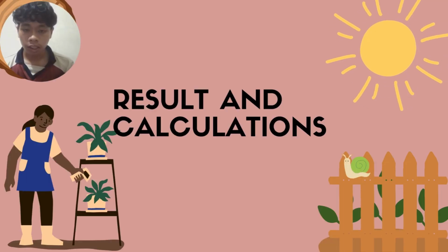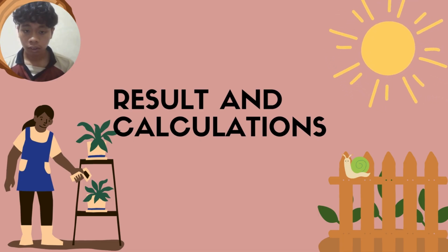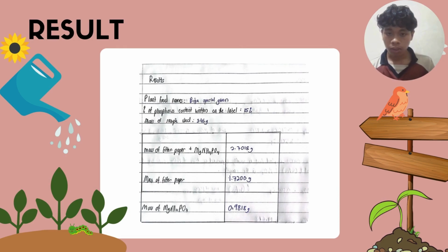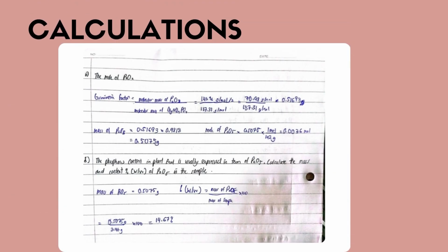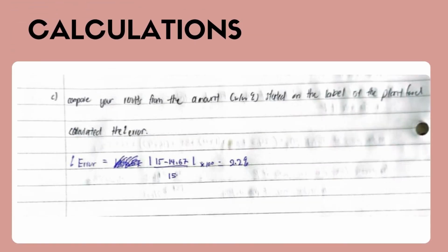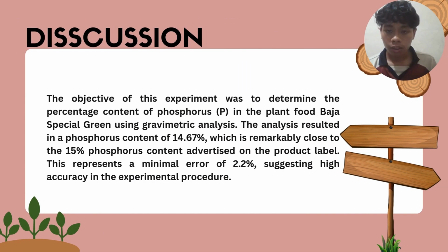Next, we get the result and calculation. This is my result for the experiment. The last thing we go to is the discussion.